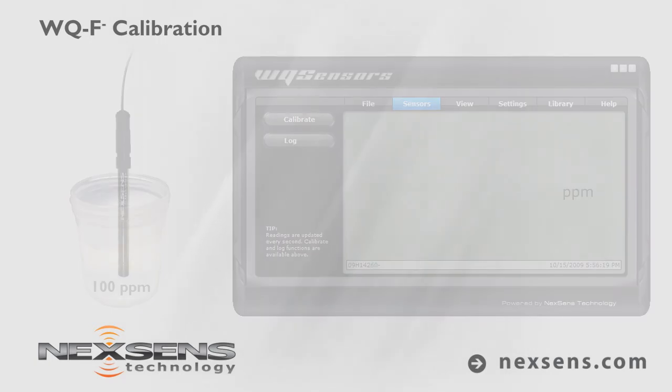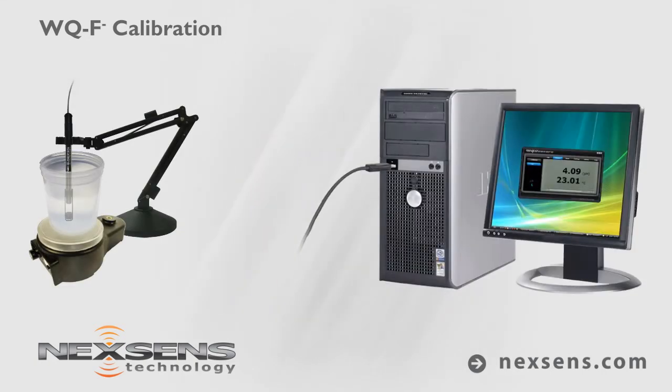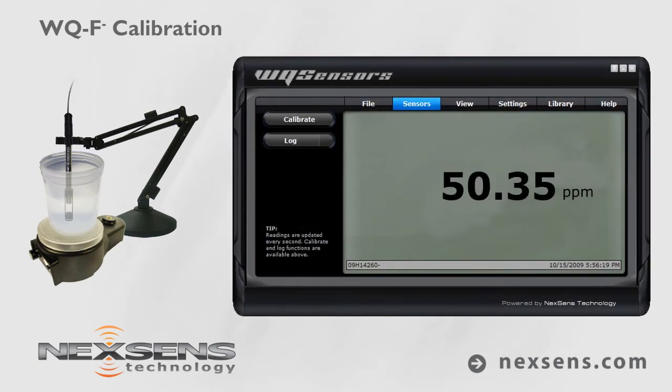Calibration is complete and the probe is ready. Use the ionic strength adjuster at a one-to-one ratio of ISA to sample solution. Make a measurement by immersing the probe in the sample. Gently stir the sample with the probe, or use the sensor tip stirring adapter with a laboratory stir plate. When the fluoride reading stabilizes, the measurement is complete. Press the log button to store the readings with a date and time stamp.